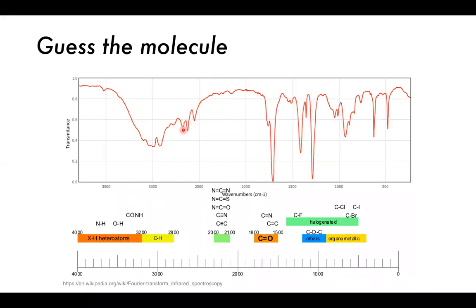Okay, so a little bit of, I guess, the molecules. This is an FTIR spectrum of a certain type of molecule. Here at the bottom are some characteristic peaks, which may be useful for you to try and identify the molecule. Just give it a go. See if you can even just identify a single bond that might be present or not.